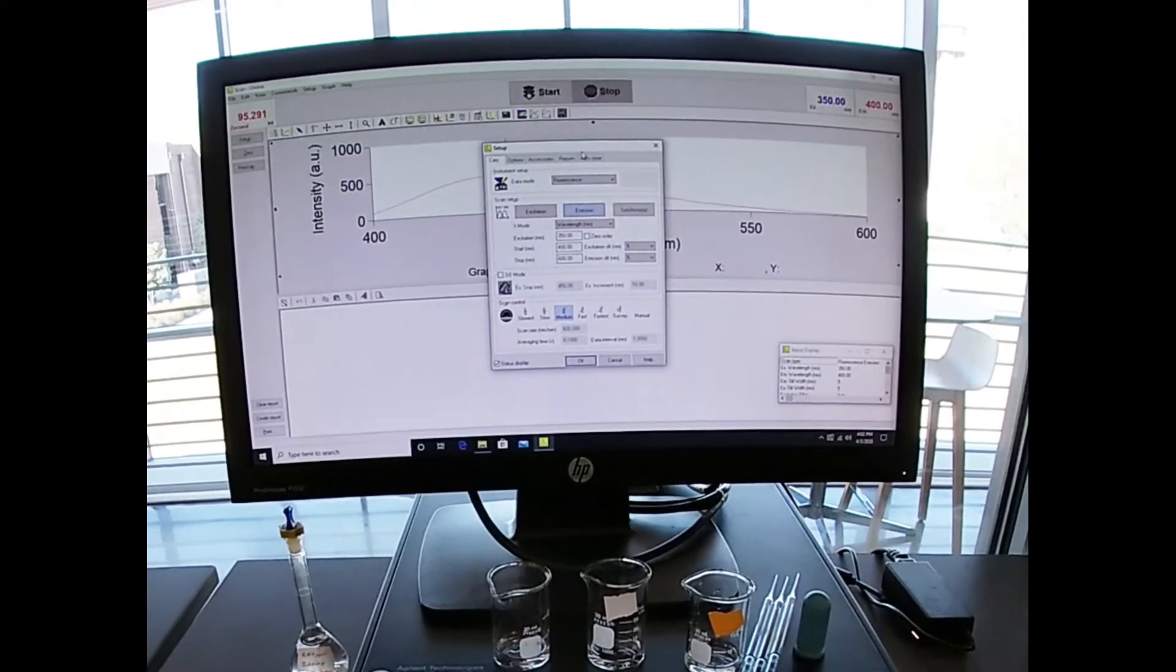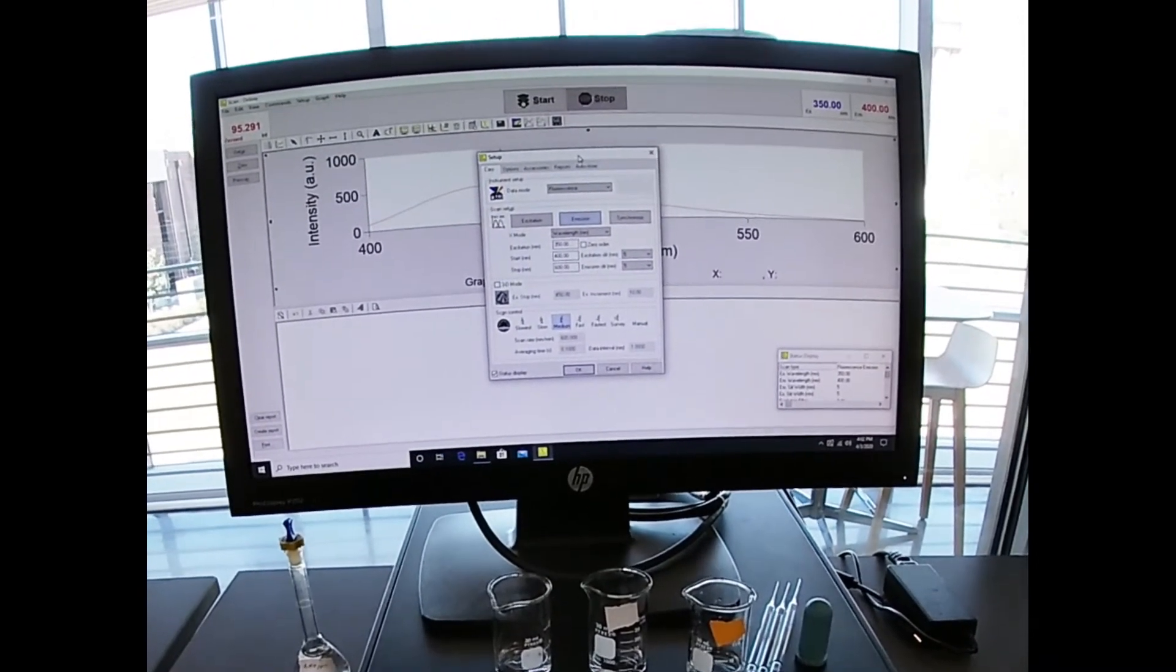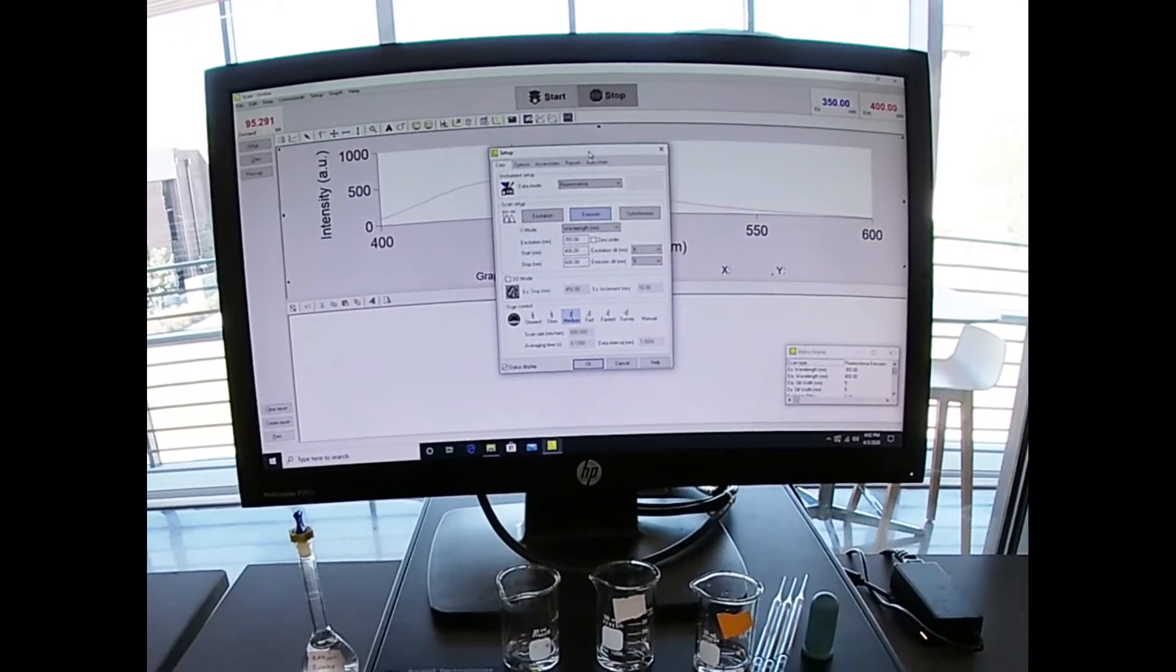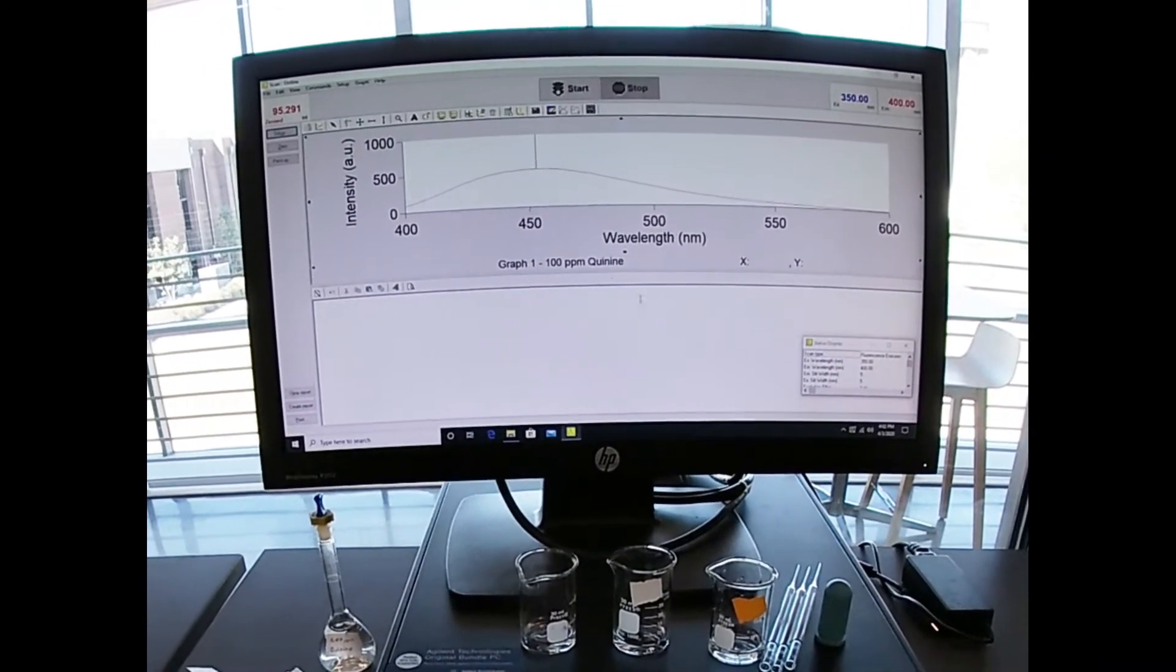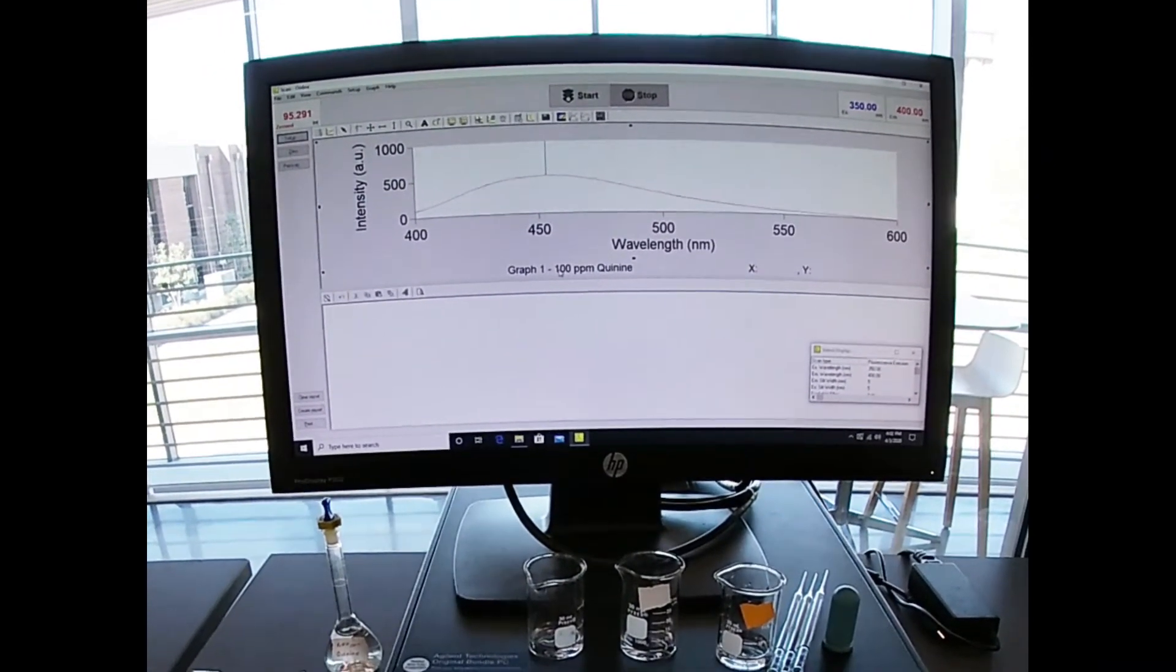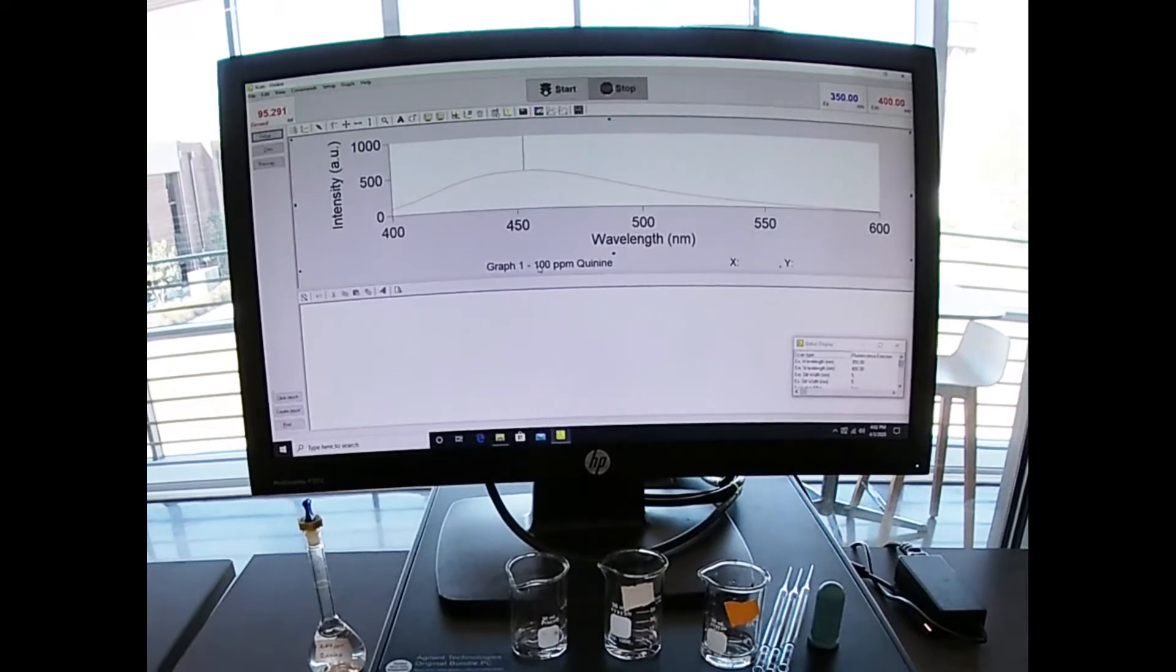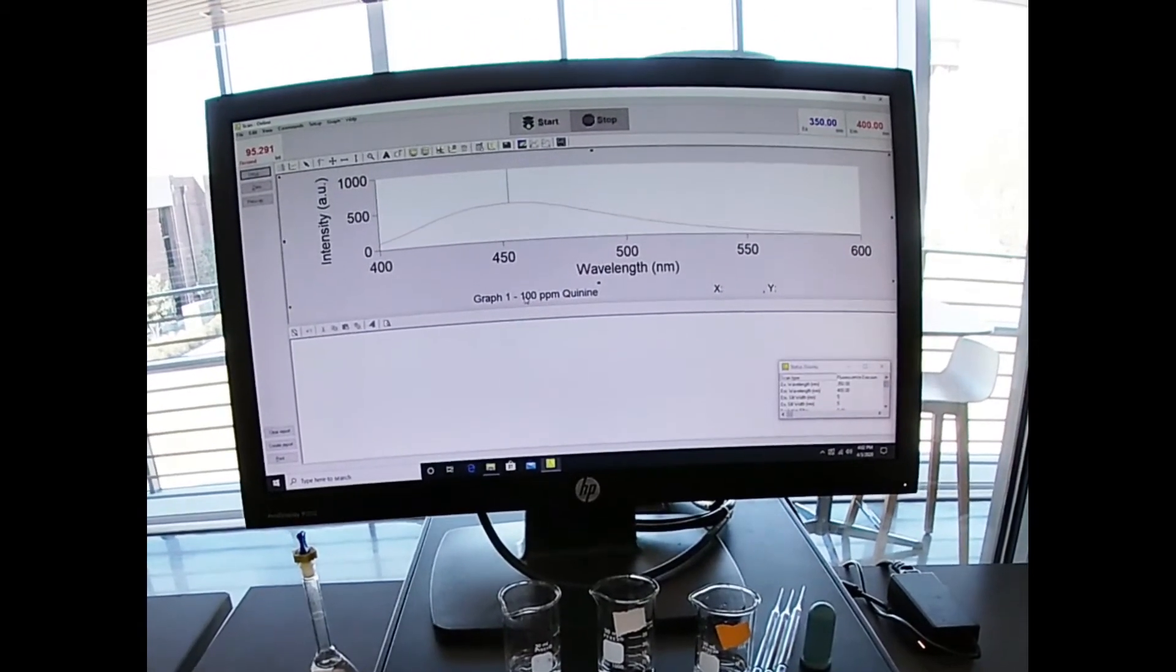The lab manual suggested using 445 nanometers. I've done a preliminary scan using the one ppm quinine solution, and we're actually seeing that most of the fluorescence is right around 455 nanometers.